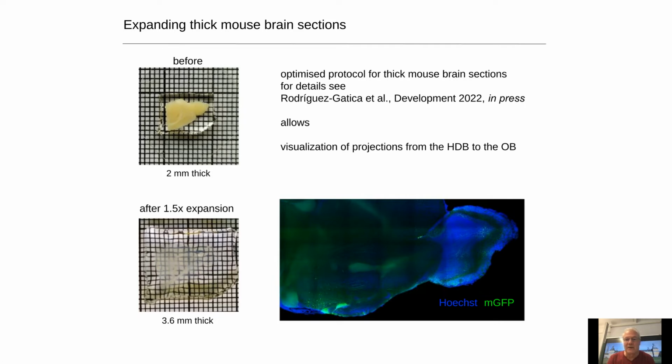Okay, this technique we then applied to thick mouse brain sections, and that will be described by Juan, along with the results that we achieved in this manner.